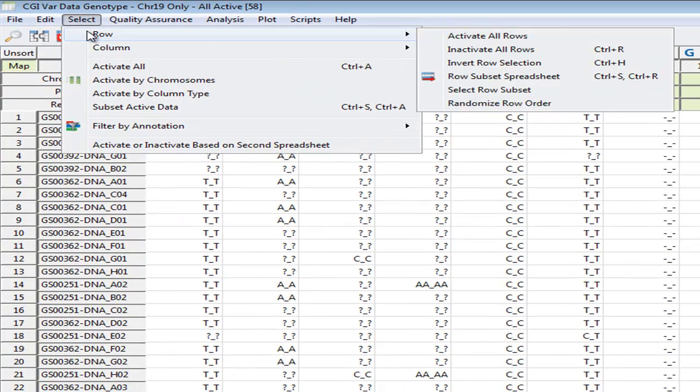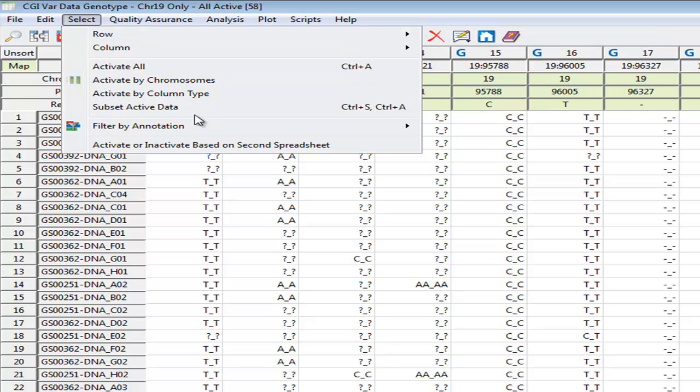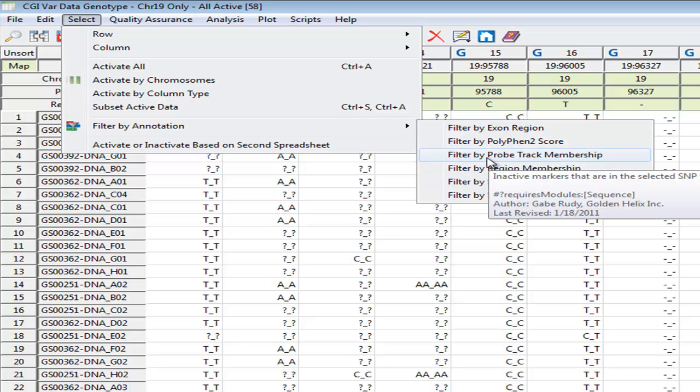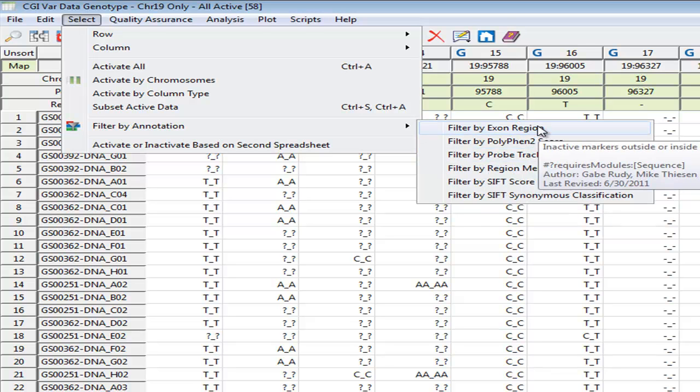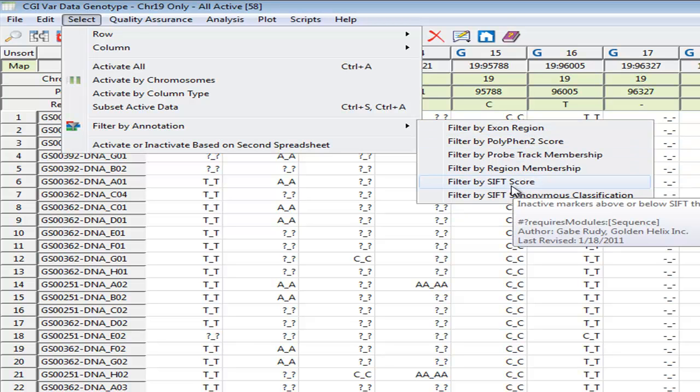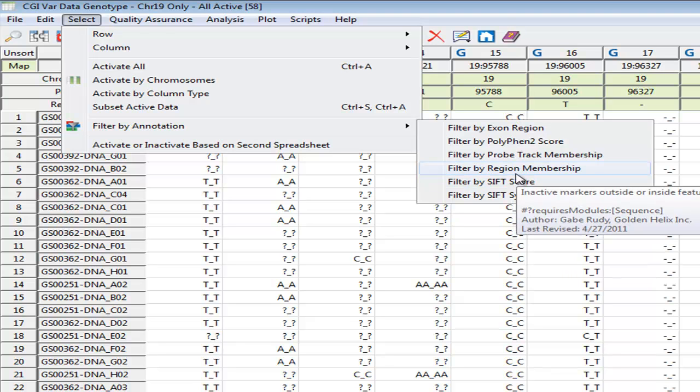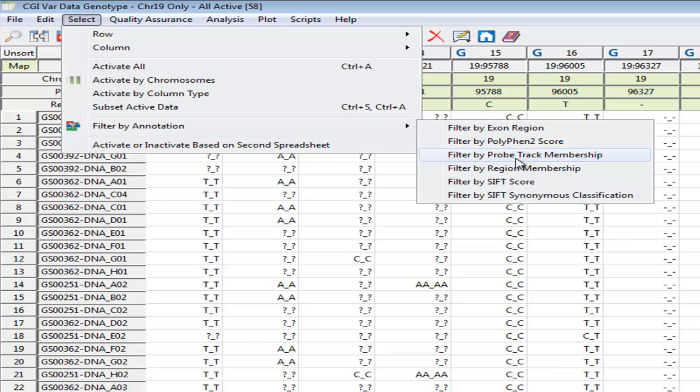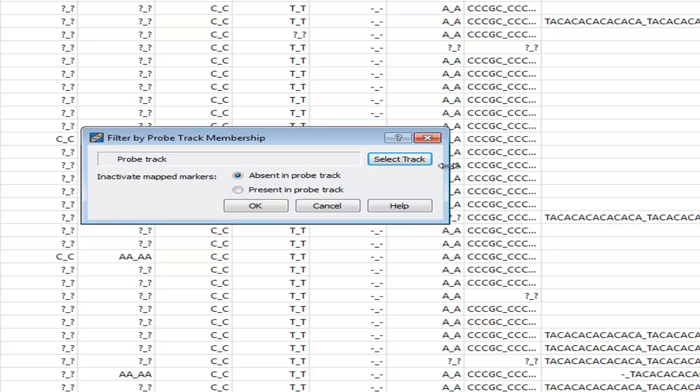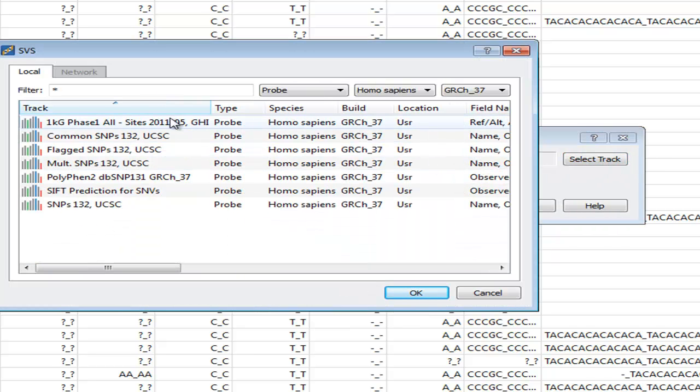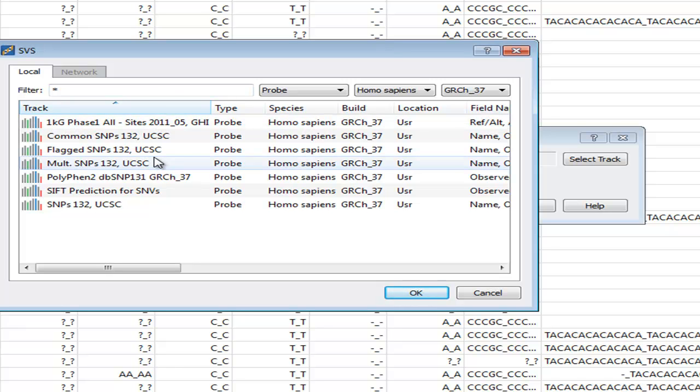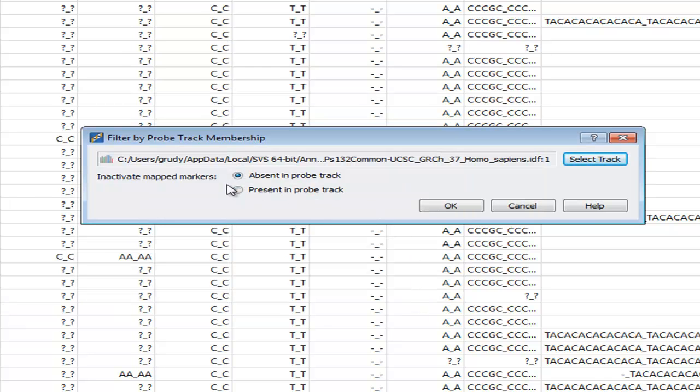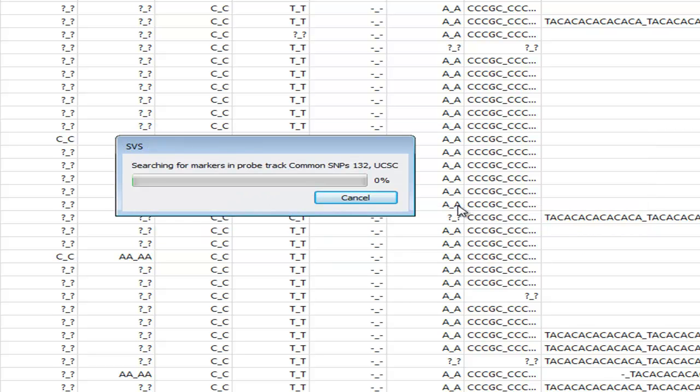Next, we're going to start our filtering process by going to select Filter by Annotations. And here you see a number of filtering options for our sequence analysis module. Some of these we're going to be using in this tutorial, and we're going to use the Exon regions later on. But we're going to filter by ProbeTrack membership, which allows us to filter by these publicly annotated data sources that we've curated and you can download when you want to follow along. So to start with, let's filter by the dbSNP132 database of common variants. We want to remove those common variants, so we will inactivate markers that are present in that ProbeTrack.